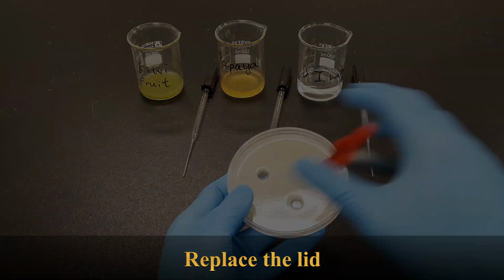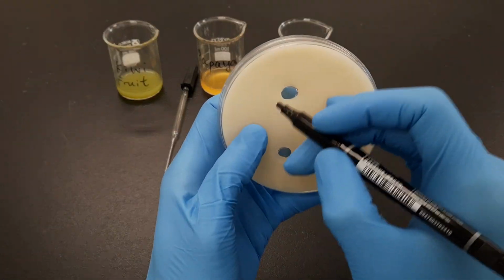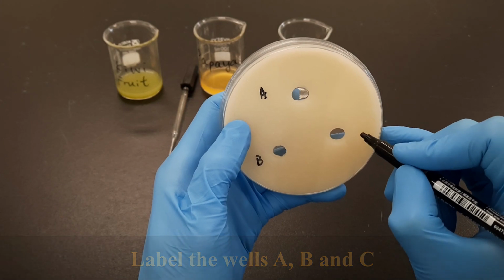Replace the lid. Label the wells A, B, and C by marking on the back of the petri dish.